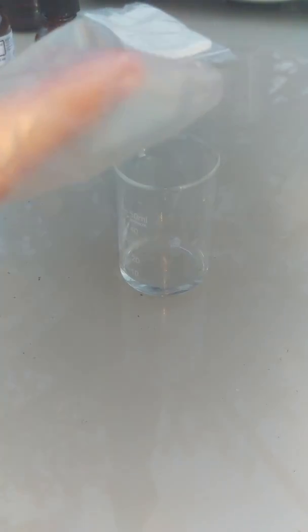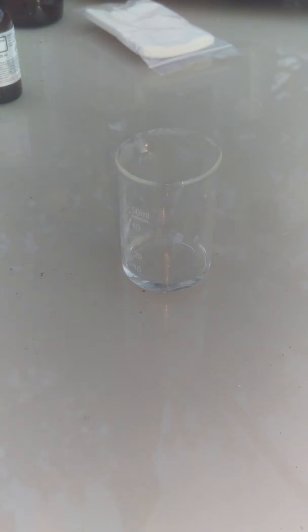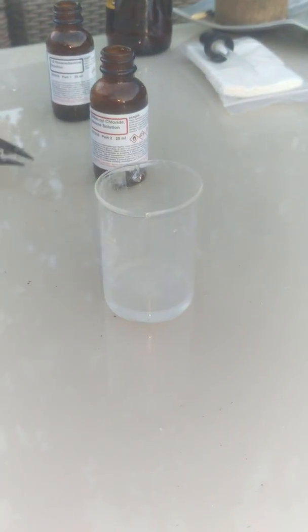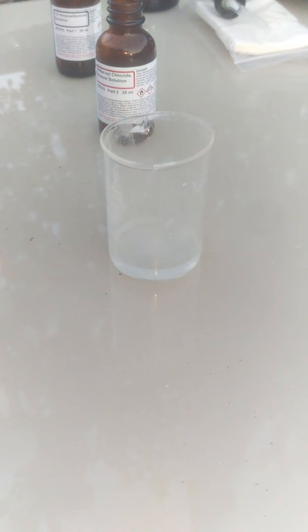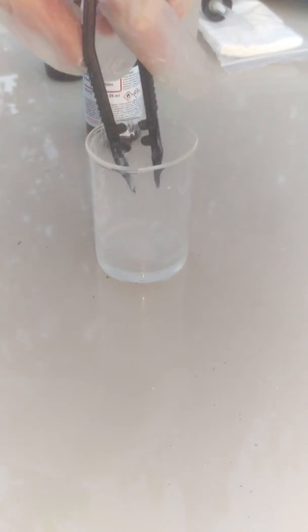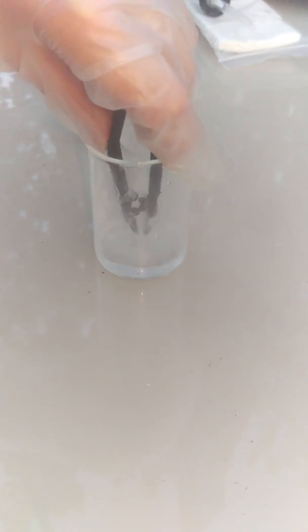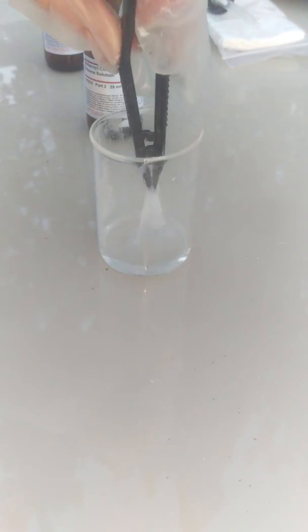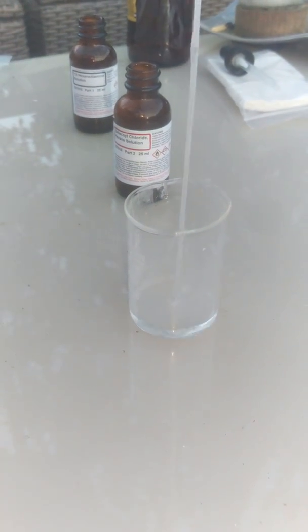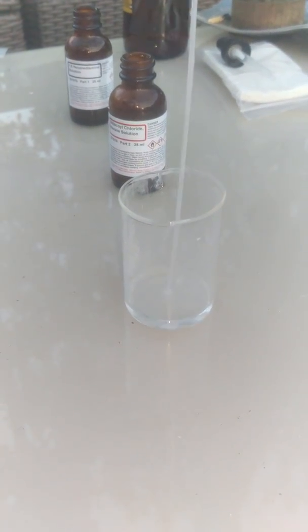And then you want to pour in the sebacoyl chloride. I've used this before for purposes to see if it would blow up or anything. And then what you actually want to do is you want to pull it out with your tweezers.